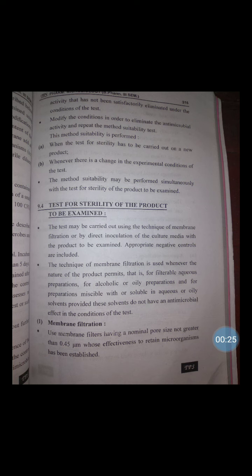The test may be carried out by using the technique of membrane filtration, or by direct inoculation of the culture media with the product to be examined, and the appropriate negative controls are included.